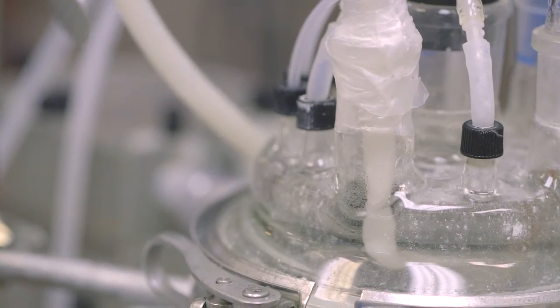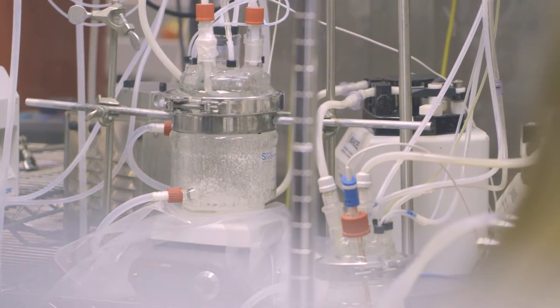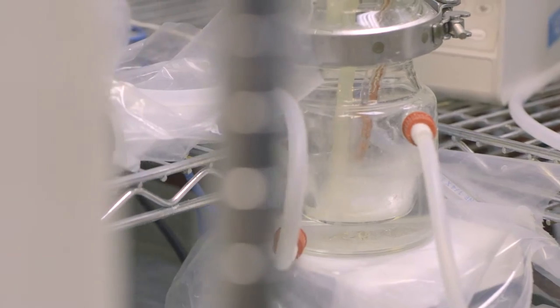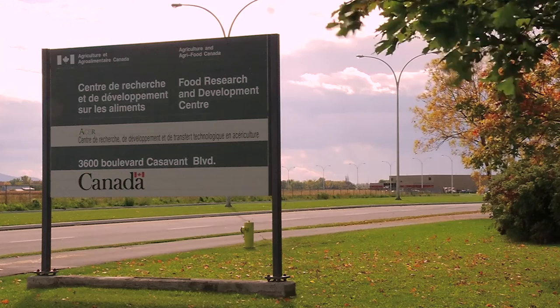The Artificial Stomach, or IVITIS, is an innovation of Agriculture and Agri-Food Canada's Food Research and Development Centre in St. Hyacinth.